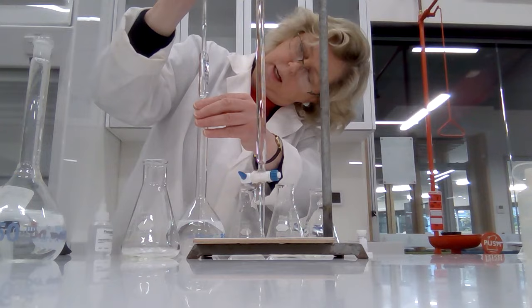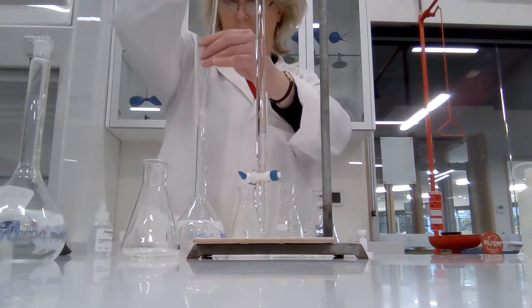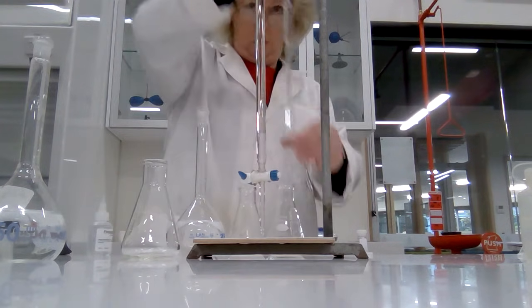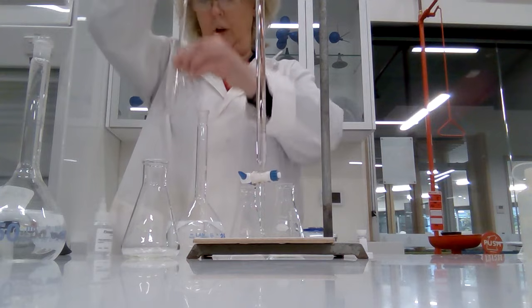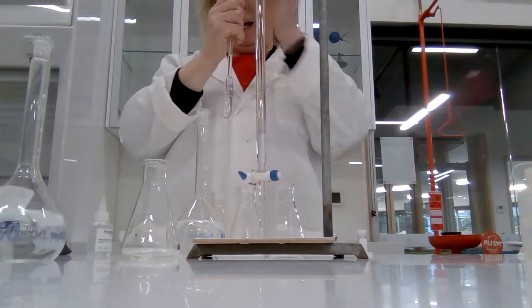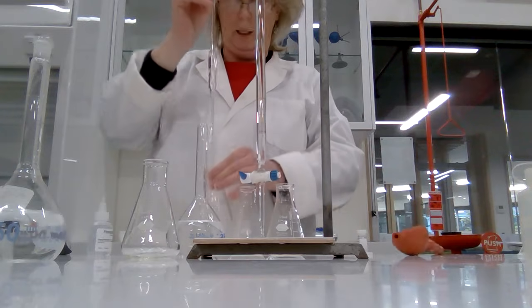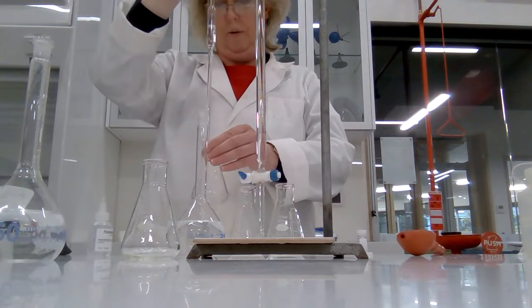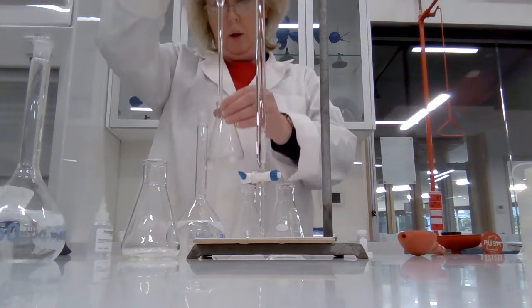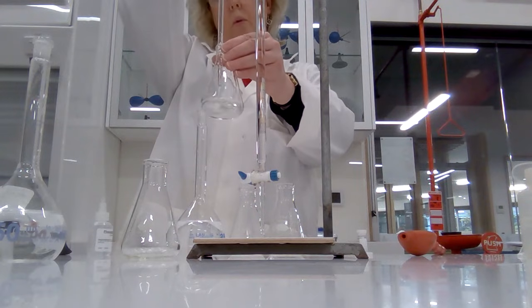And then you transfer to your volumetric conical flask. I like to do it by taking the end of the filler off the pipette and just letting it drain. So we now have three flasks, each with 20 milliliters of oxalic acid.